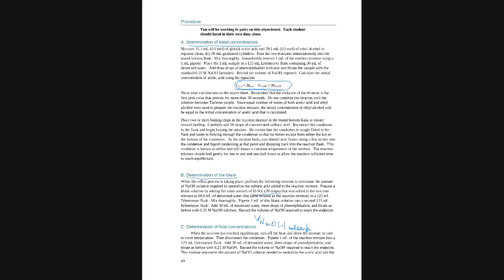Why? Because when we get to part C, we are going to say the volume in C of sodium hydroxide that I will use in the equation up here. Before I go to the equation, I will say the volume, and this volume is the volume that is reacting only with acetic acid.